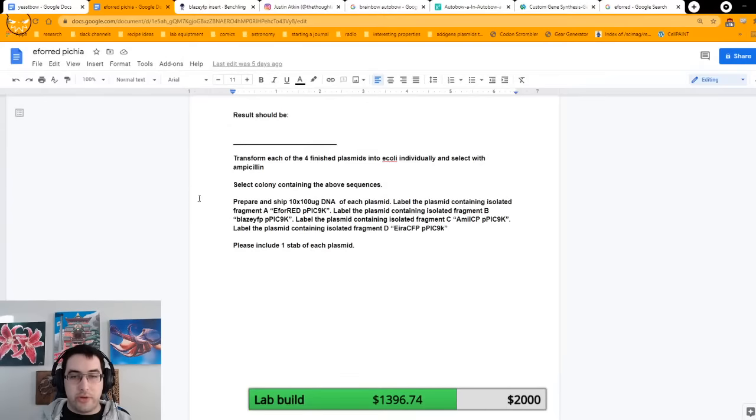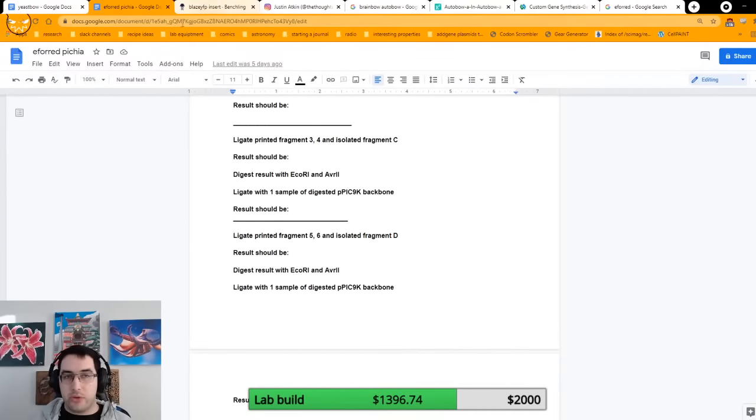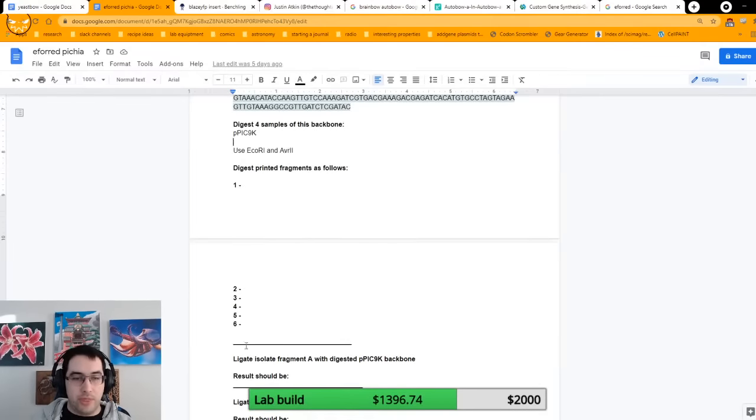So there are a couple of things left in here that I've got to sort out. I've already written the ending bit: transform each, select a colony, prepare 10 by 100, and then how to label everything. But the last thing I need to fill out is what the results should be. So I'll show you all the plasmids that I've designed, and I need to fill out what fragment needs to be printed with what, or digested with what enzymes.